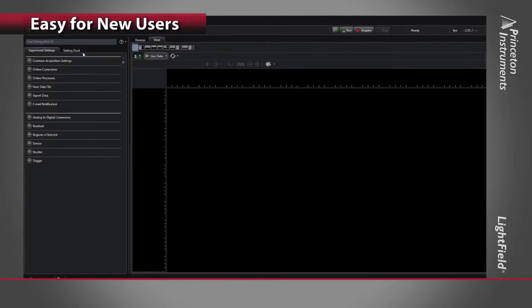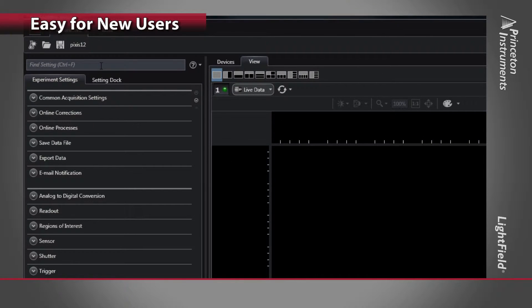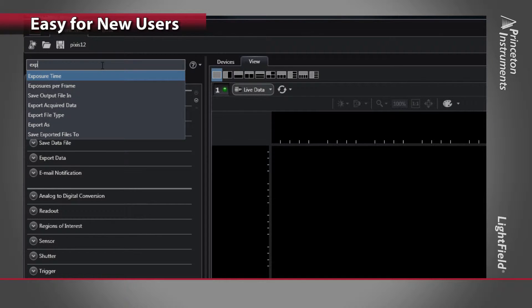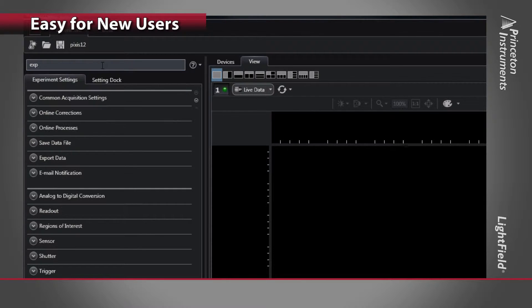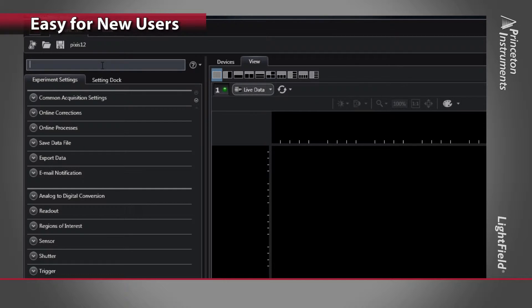For example, by using Smart Search, a new user can simply start typing to discover available settings and controls, just like using your favorite search engine. Also, context-sensitive help is just a click away.